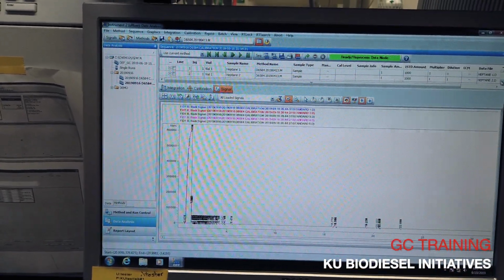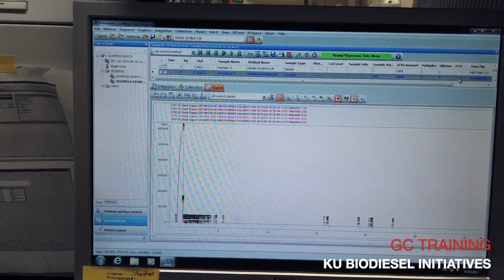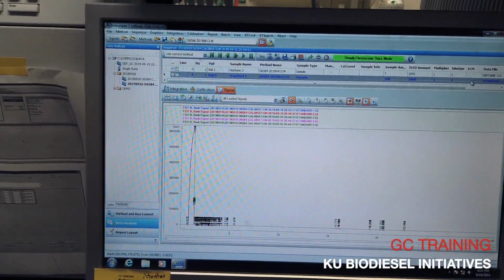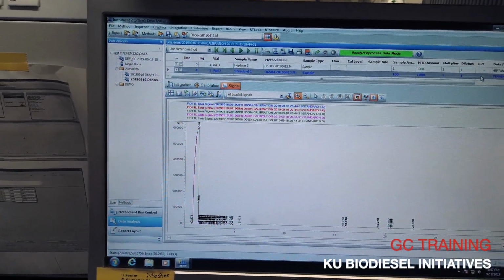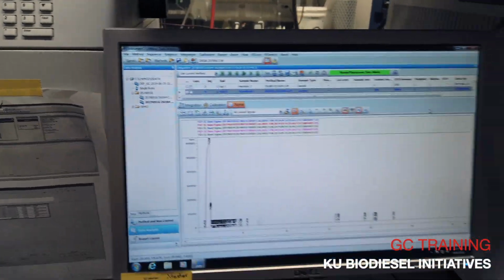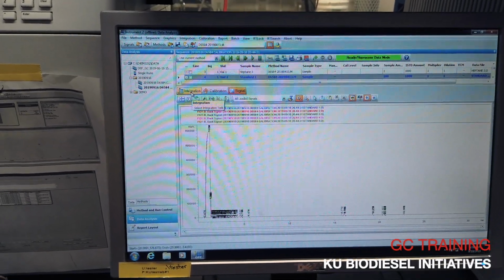I don't necessarily know how beneficial it'll be to go through the entire calibration together. I mean, you guys tell me if you think it's going to be too much.